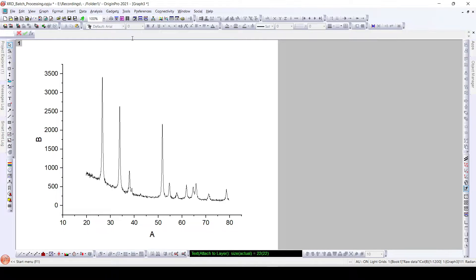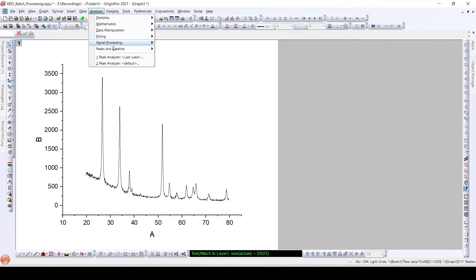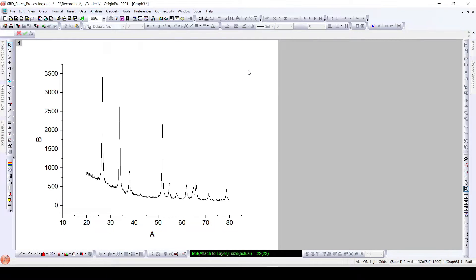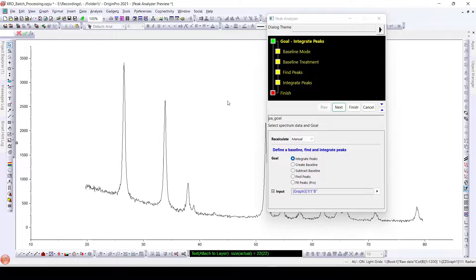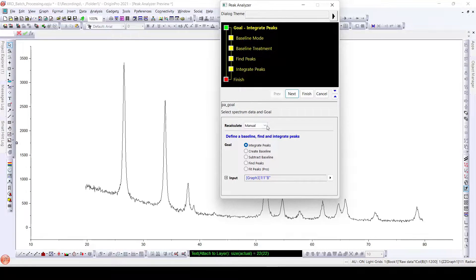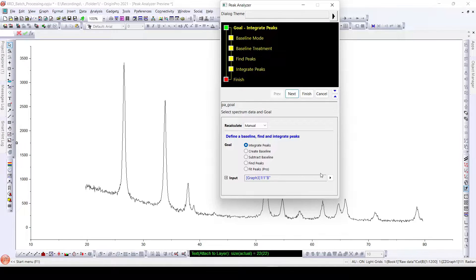To calculate the degree of crystallinity of this XRD pattern, we need to go to Analysis, Peaks and Baseline, Peak Analyzer, Open Dialog. We have already seen this Peak Analyzer dialog for calculating the crystallite size in our previous video. Here we will integrate the peaks — calculate the area of the peaks — and then divide that area by the total area of this pattern. For this, we will select Integrate Peaks.